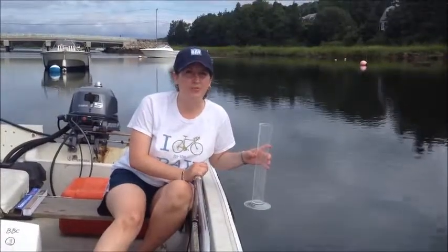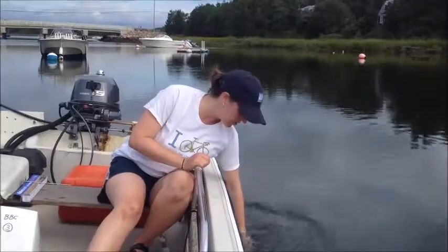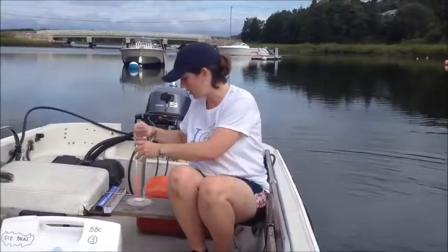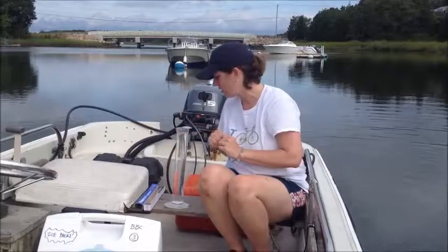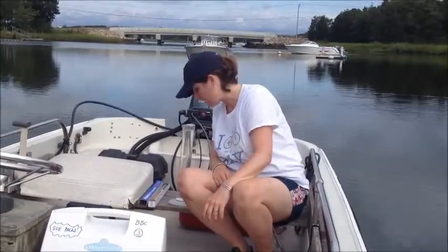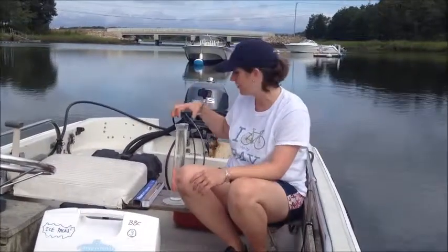So as a part of our water quality sampling, both for dissolved oxygen and for nutrients, we measure salinity and temperature. And in order to measure temperature, we get about 500 mils of water in our graduated cylinder. We place our thermometer in there, give it a few seconds to reach the ambient temperature. And the temperature right now in this water is 25 degrees Celsius.